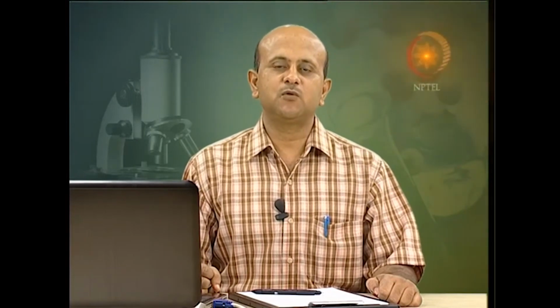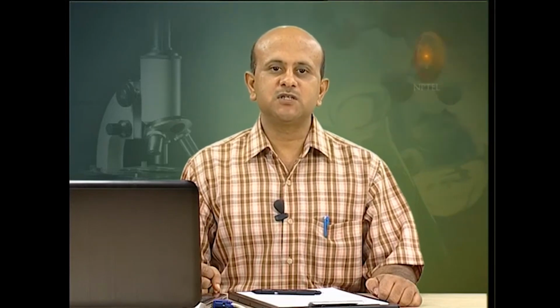And then we have discussed continuous flow rotors, and we have taken one example of the elutriator rotor, which has a conical shaped chamber in the rotor, and there is an inlet and outlet on the other side. There are two forces, one being the flow of the material, and this rotor is utilized for large volumes where the solid material is very low, but volumes are large. So, it is continuously flown into the rotor. The particles sediment at different positions, as we have discussed, and the effluent without the particles will move out. So, these were the rotors.